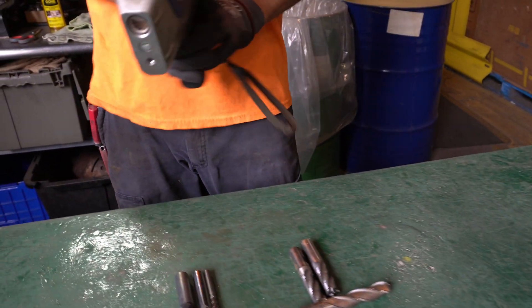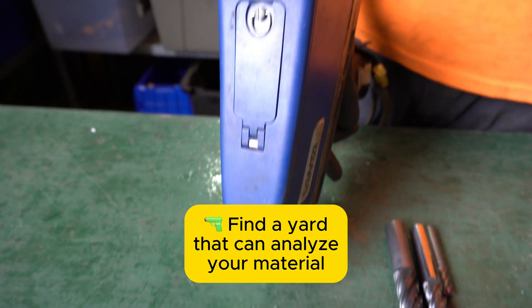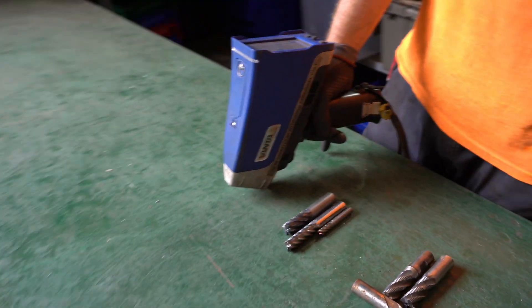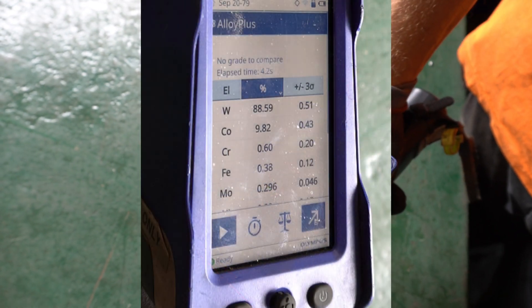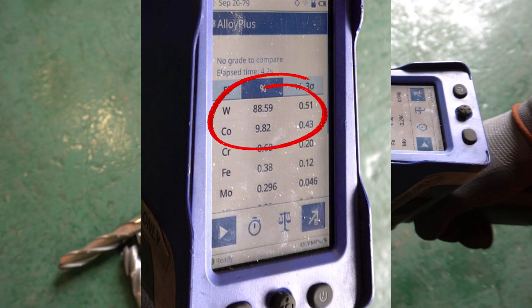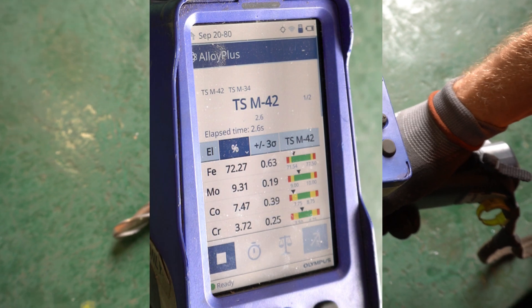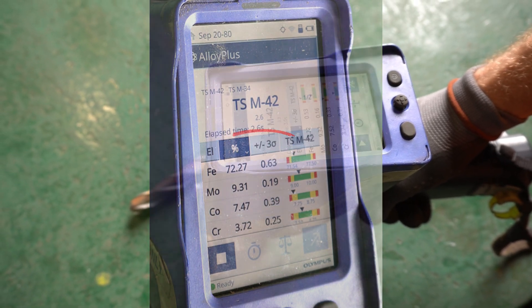If I have any final questions, comments, or concerns, what I'm going to do is take our spectrometer right here. This is going to give me a breakdown of the percentage of what the material is made out of. A few seconds of shooting this is going to show me the material composition. I'm looking for tungsten and cobalt — that tells me we have carbide. When I shoot the high-speed steel, the majority of it's going to be iron, which is usually a dead giveaway.